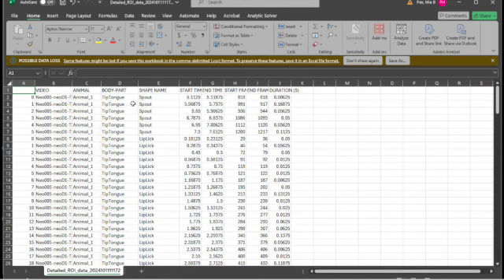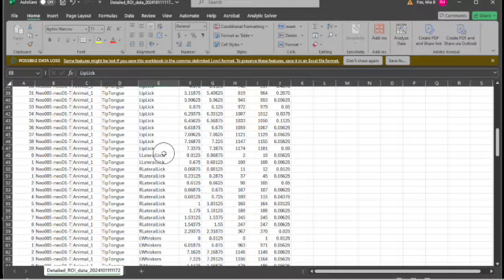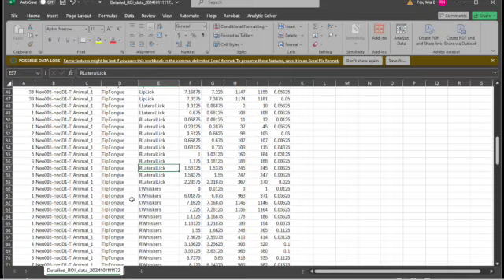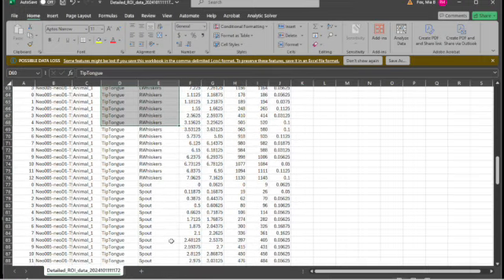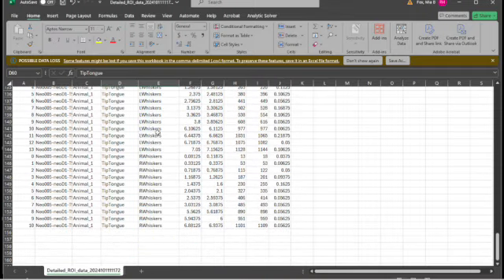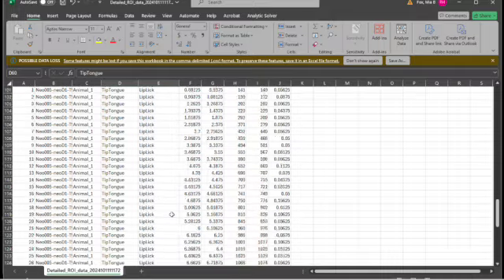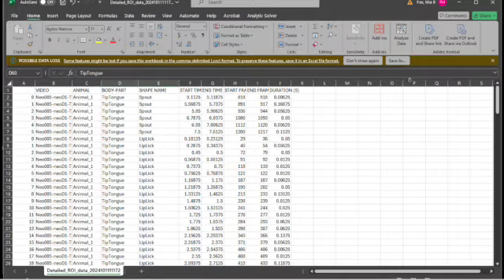However, it will only tell me when the tip tongue entered the spout ROI or the lip lick ROI region, or the lateral lick region. Oh, I guess at some points it entered the whisker region. So those were probably errors in the DeepLabCut training. So it's important to look back through this and see where it's detecting the body parts in which regions, because I shouldn't be getting any in those whisker regions.